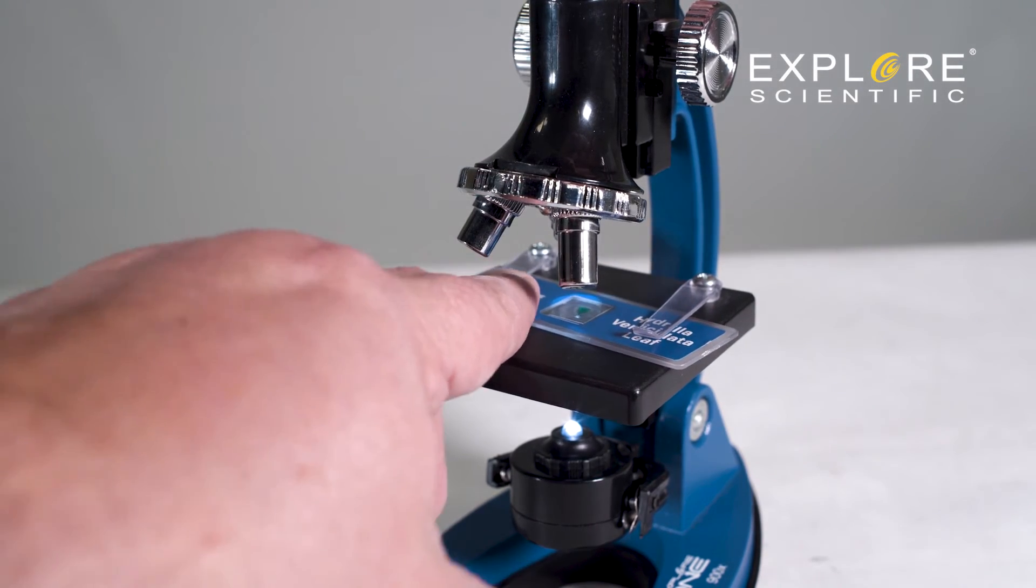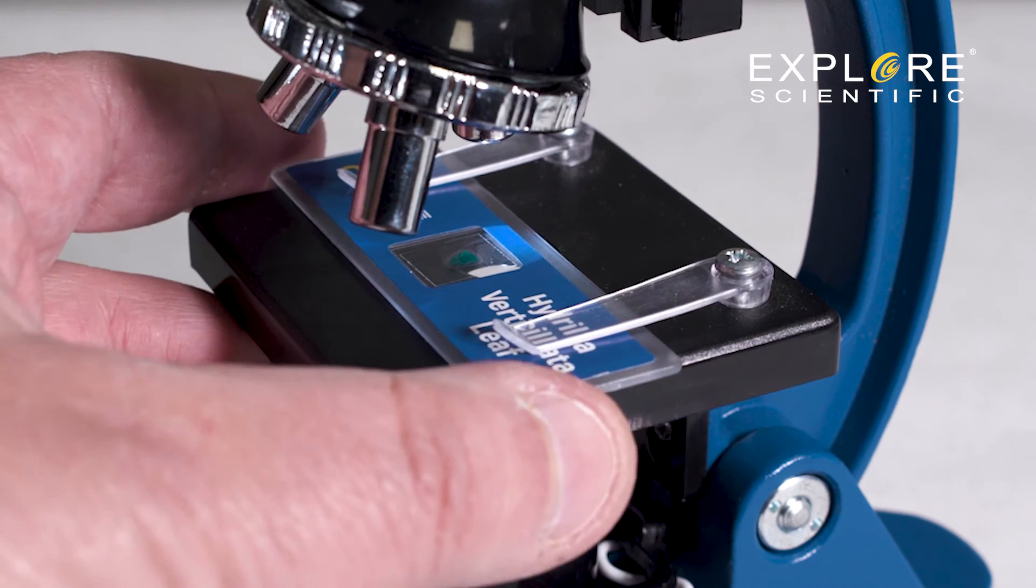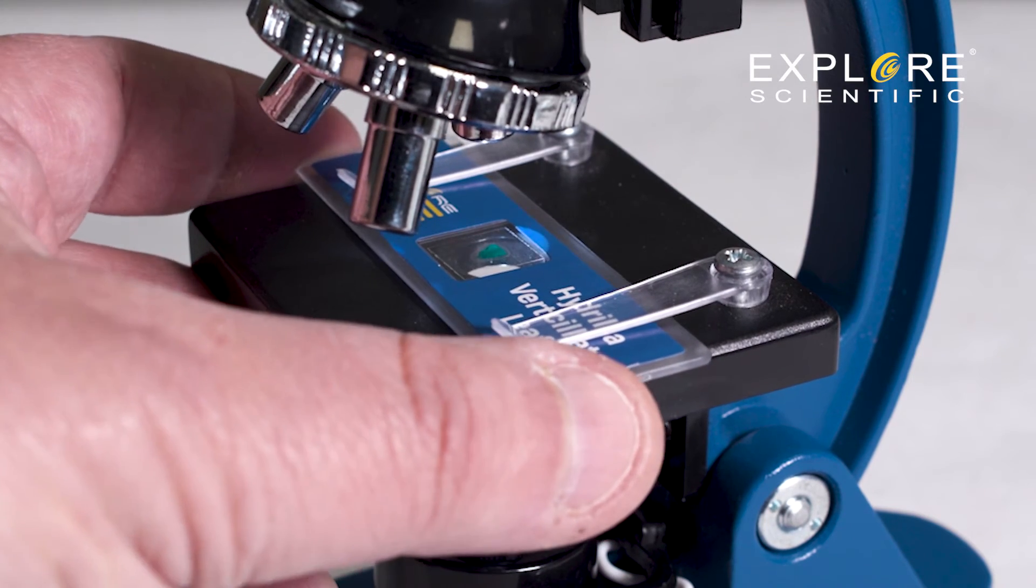Place the prepared slide on the stage, being sure to get it under the clips. Adjust the positioning so that the edge of the specimen is halfway across the opening of the stage, the hole where the light shines through.